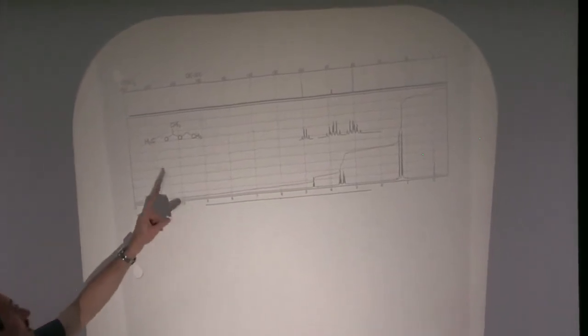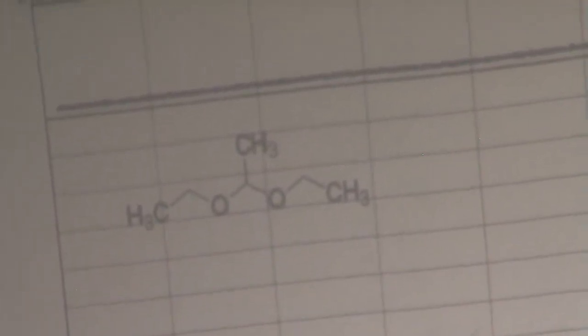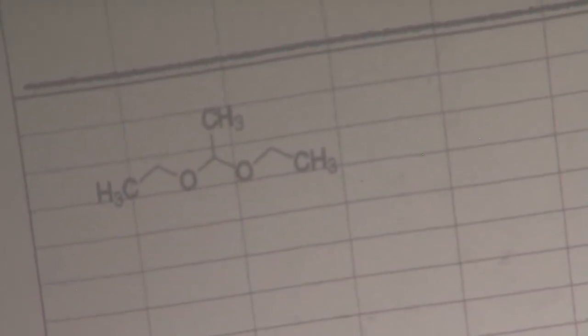All right, so what do we have here? We have a couple of ethyl groups, and we have a methyl group. The CH3s of the ethyl group appear here as a triplet. So this is OCH2, CH3. That looks pretty reasonable. We have another methyl group, it appears as a doublet. That's our CH, CH3. That looks pretty reasonable.